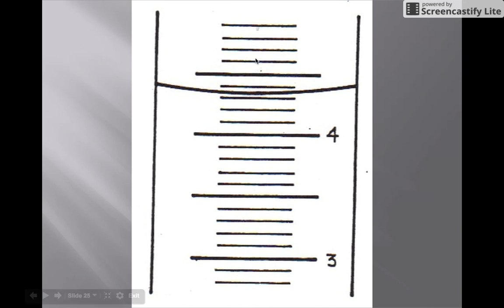And now I have to get into the land of doubt and estimate what this is. And I'm going to take this amount of space and divide it evenly in my brain into 10 spaces, 10 little sub spaces. And I have to imagine it. And now I'm going to look for the bottom of the meniscus, which is going to be right in the center of the tube. And I'm going to guess what this is. So if this is 4.3, then this is going to be 4.3 something.